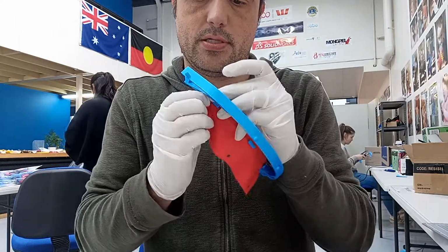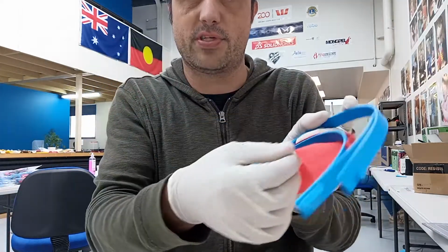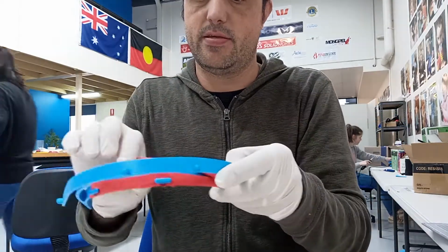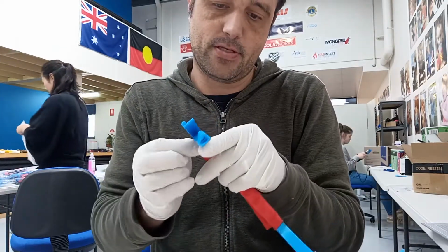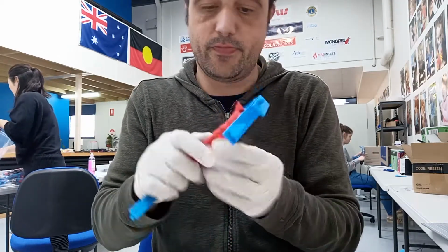It's a bit hard to do. Here we go, so it should be nice and tight. And then that wraps around and back onto the same lugs at the front. It's nice and tight. Look at that.